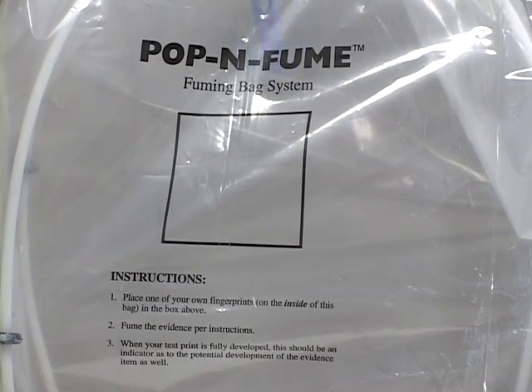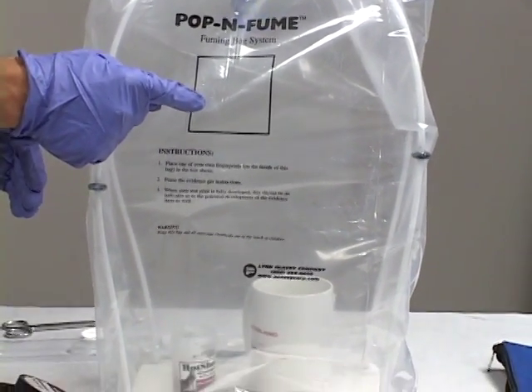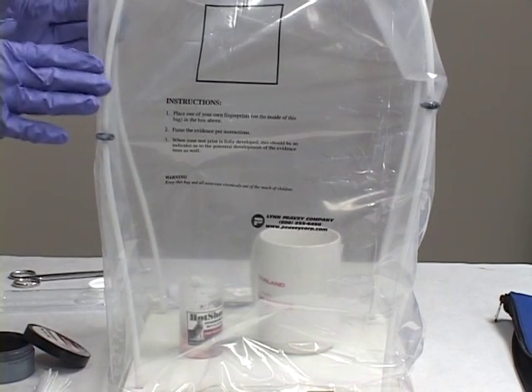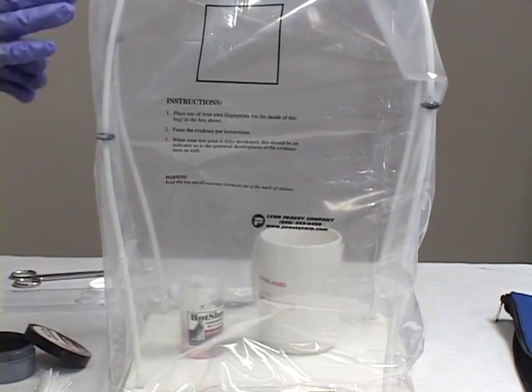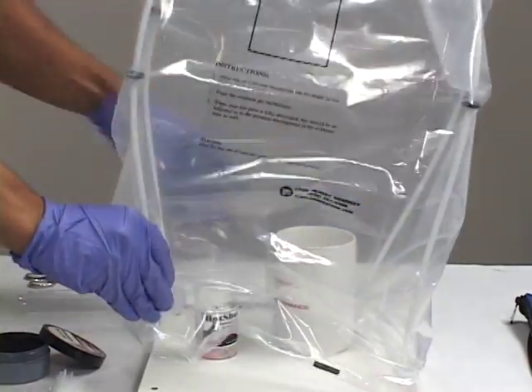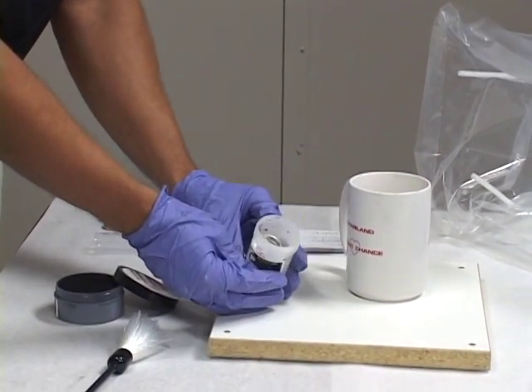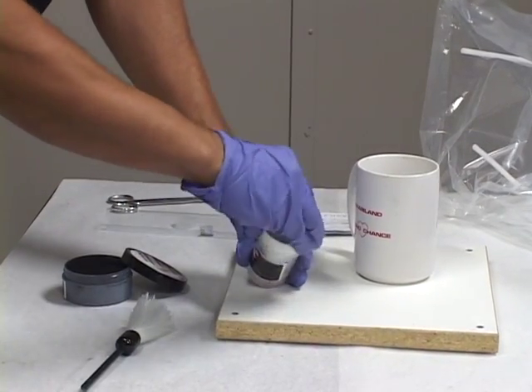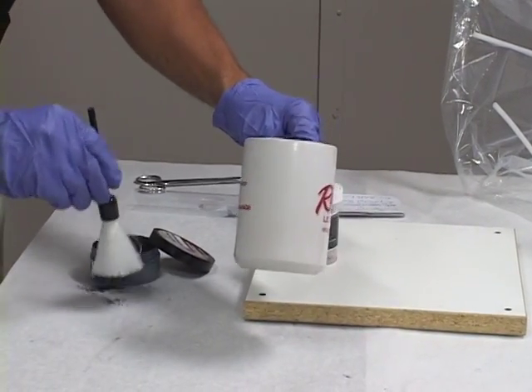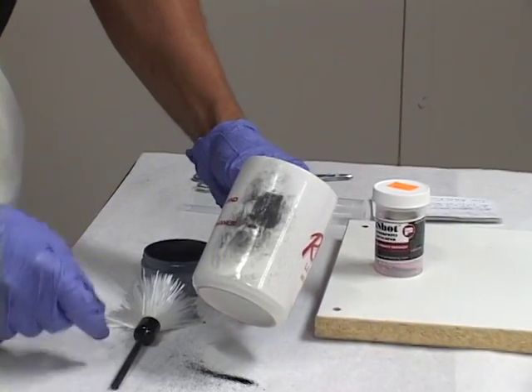A few minutes have gone by. You can see that the canister has stopped fuming. Our fingerprint that we put on the inside of the bag is now visible. Now I'm going to remove the hood. As in any superglue fuming, you need to open it outside or under a fuming hood or in a well-ventilated area, because the superglue fumes are dangerous. We can see that the canister has stopped bubbling. We'll put our cover on that — now that can be discarded. Now we're ready to process our evidence.